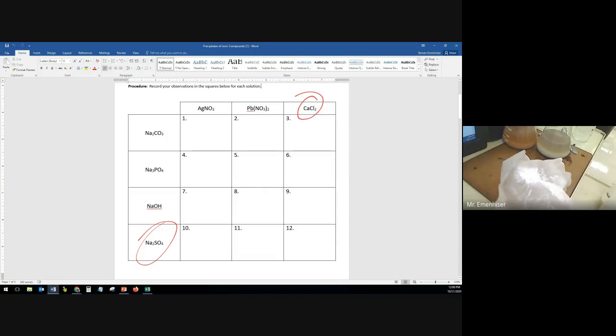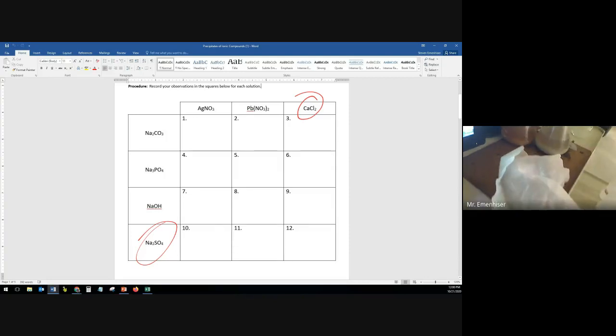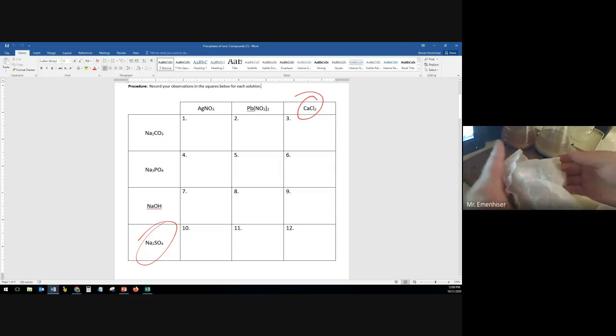It's a little too bright. Maybe that's better. You can see better. Less light. Okay, let's see. Not really. It was better before, wasn't it? But now you can see that solid.